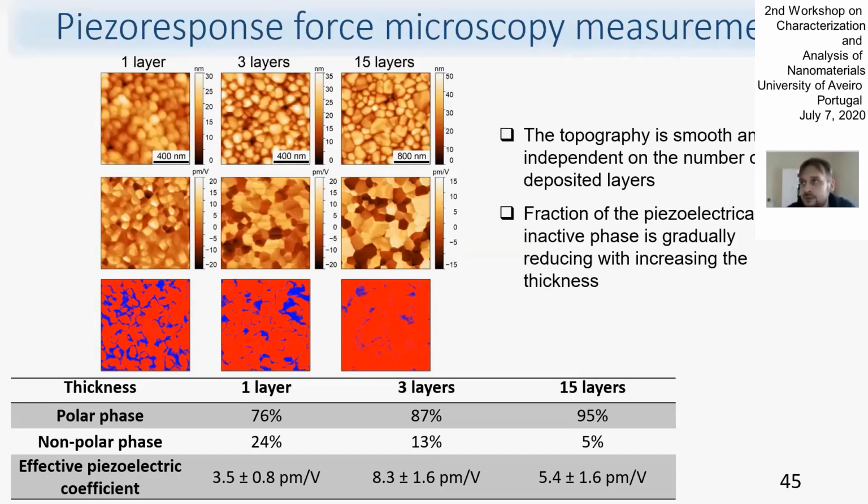Now quantitative PFM measurement is rapidly developing, which means that we are not only measuring contrast, like seeing the different orientations of the polarization, but we also can quantify the piezoelectric coefficients with high accuracy. We can, for example, extract the values of the polar phase and non-polar phase and compare them.